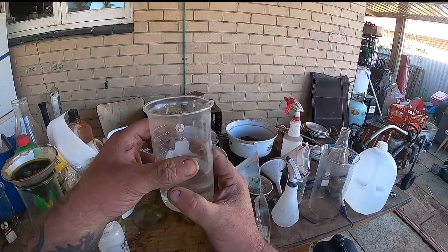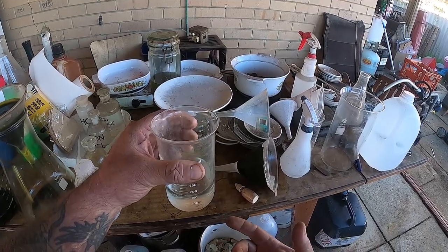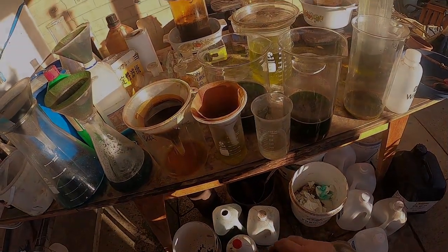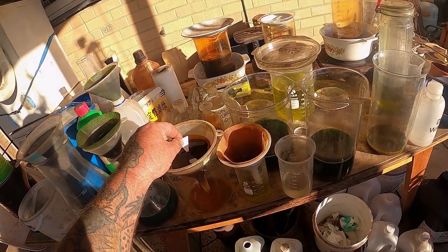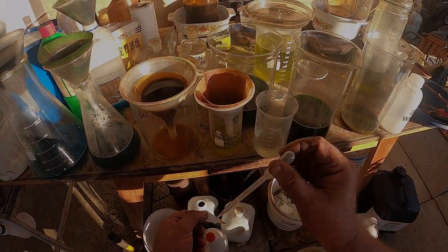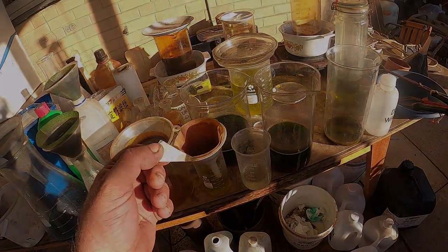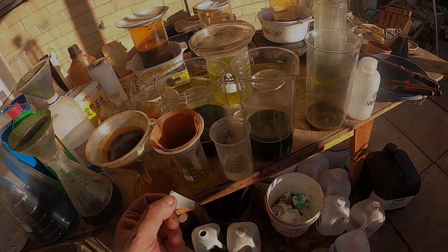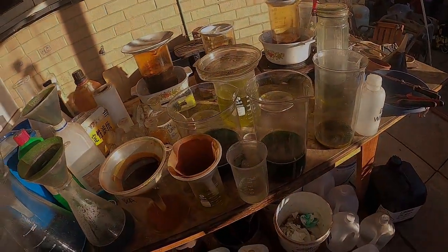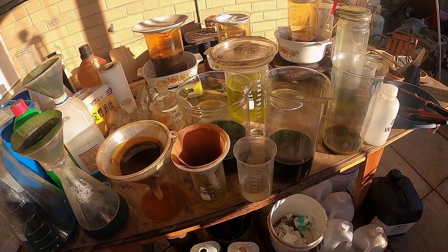Now I'll show you on some gold-bearing solution how this works. I've got some gold solution here — let's get a little bit on some paper and try this new stannous I just made. It should go black... there you go, that's a positive for gold using the stannous we just made. So that's all you have to do — it's so simple. Half the time you end up making it by default when you're soaking things in hydrochloric acid to remove solder, so you don't even need to go out of your way to do it.